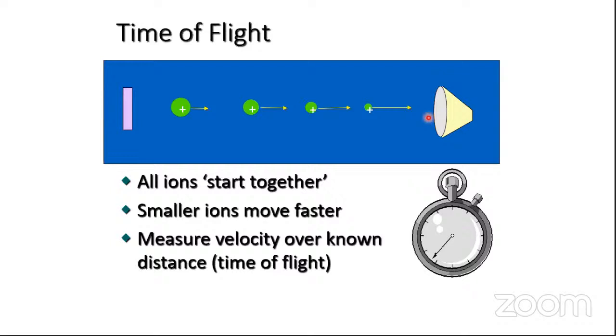So you need to calibrate. Even the quadrupole and all the mass analyzers require something called mass calibration or tuning with a known sample with known masses. And once you calibrate it, then it works beautifully for all the masses which you have. So mass calibration is very necessary for the mass analyzer. It is the same thing which is required in spectroscopy also. You need to calibrate the spectrophotometer for wavelength calibration. So same thing here, the x-axis m/z as well as the y-axis, the detector output, needs to be calibrated.